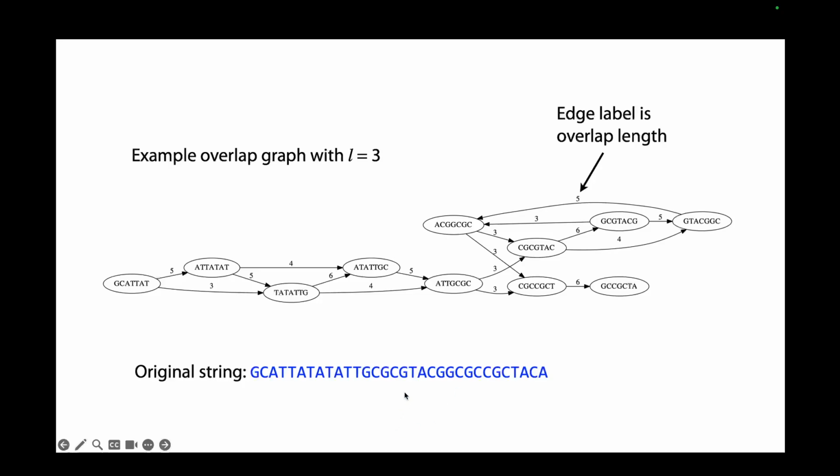Now, if you can imagine, if this small string can get us such a complicated overlap graph, you can imagine how complicated it will look if you take the whole genome. So it's going to be very computationally intensive to work on, and storing it is also a very big issue. So we need advanced computation power to resolve reads like this.